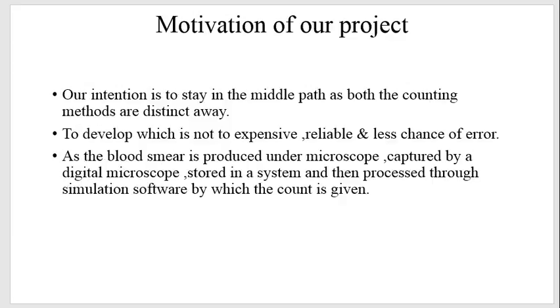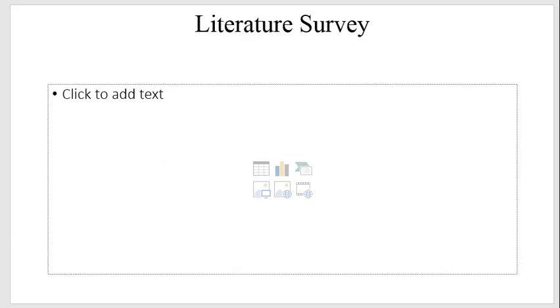So the motivation of our project is not to replace the automated counting system entirely, but to give a better solution to the manual counting process with the kind of expertise that we can get. Basically, save power, save cost, and replace human effort, that is, expertise requirements are reduced. That is the motivation of the project.